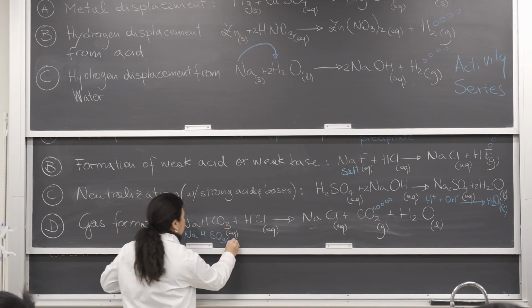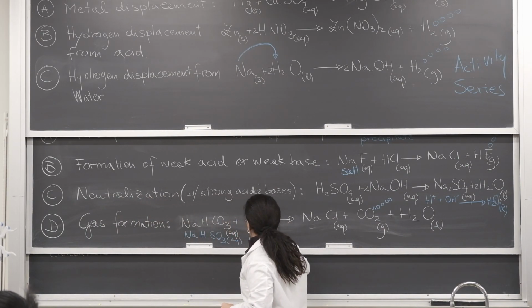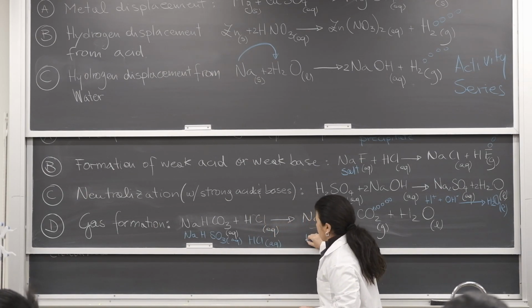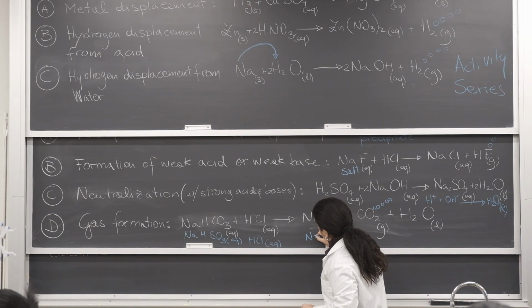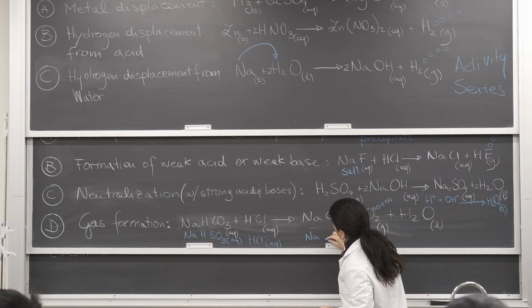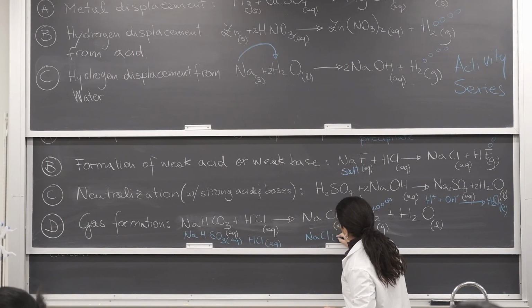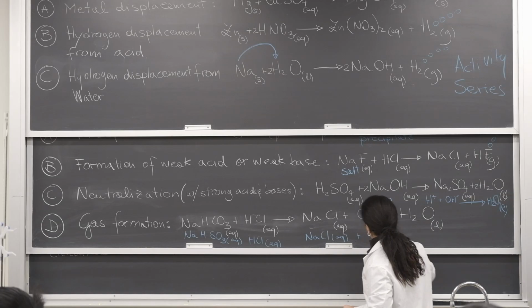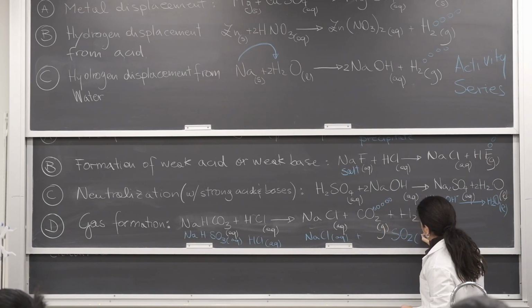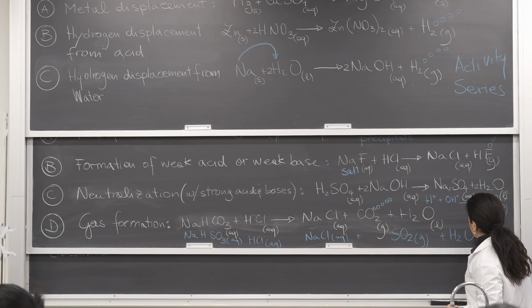Sulfite, in the presence of the same thing, hydrochloric acid, will give sodium chloride, aqueous, plus sulfur dioxide, gas, plus water.